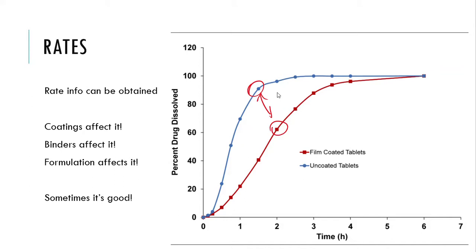will greatly affect how the pill dissolves and breaks up over time. So if you ever grab one of those pill bottles in the grocery store or at Walmart or at the pharmacy and you see the words extended relief or release, maybe it is giving you relief, but it's releasing the active pharmaceutical ingredient, the API. If you see this, this is probably designed in such a way that this pill will slowly dissolve over a course of time and not immediately just break apart and all of the inside gets absorbed. It is extended. It is slowing it down. It is preventing it from breaking apart the way that a typical tablet would.